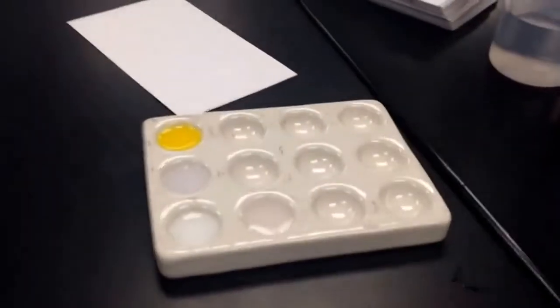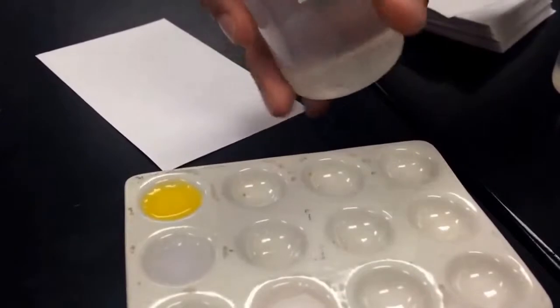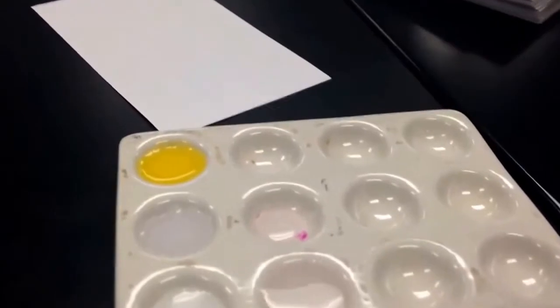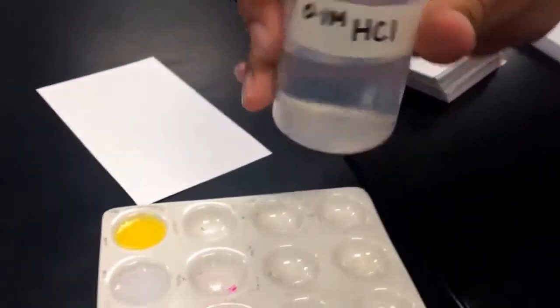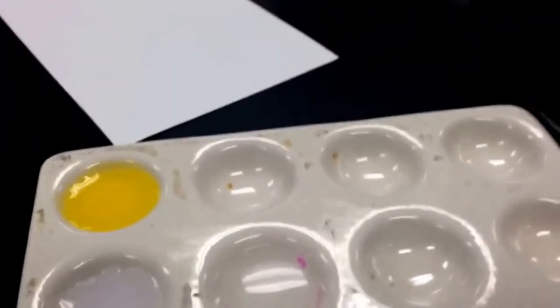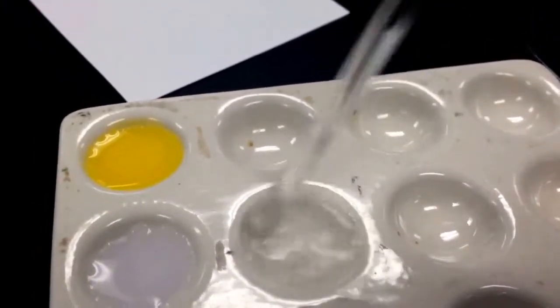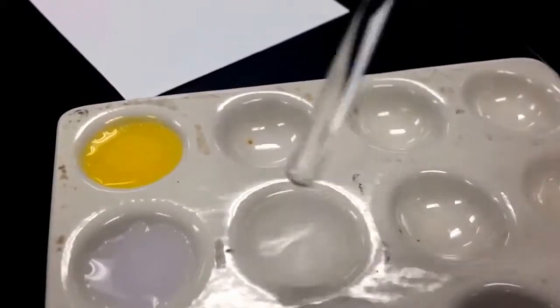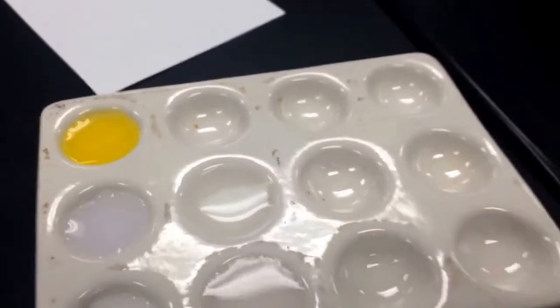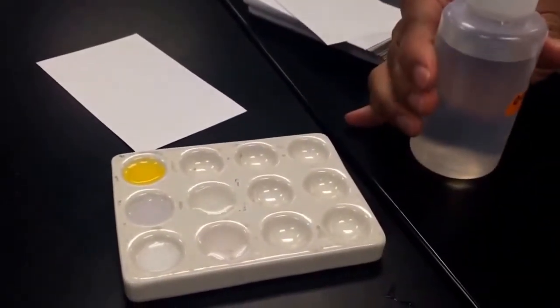Number 5 is sodium hydroxide and hydrochloric acid. They're all aqueous solutions. So here's the sodium hydroxide. And here is the hydrochloric acid. And it's purple. But I think that's just dirt from what was in there. See, it disappears. Some residue. No precipitation. But it is dirty.